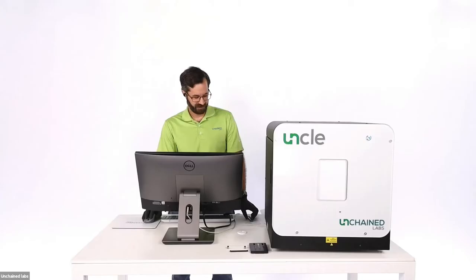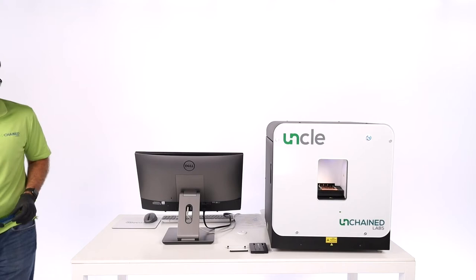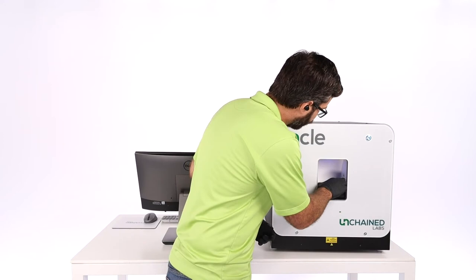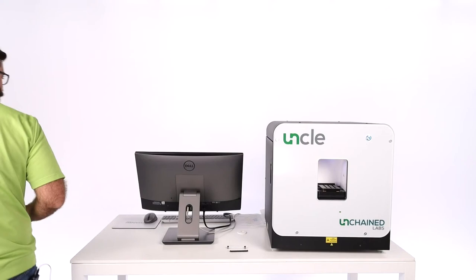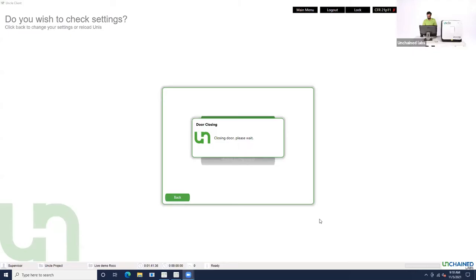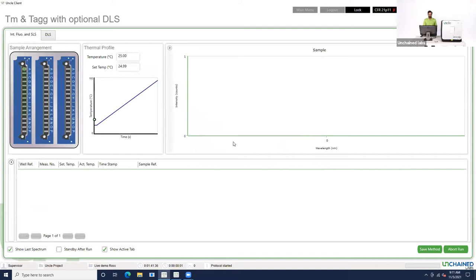Hit apply and we're going to load samples. The door is opening — let me walk around to the front of the instrument and load up our UNI. Door is open. UNI goes in — align the notch with the little peg in the back, gets held in by magnets, and then put the black plastic frame over the top. Looks like everything's nice and secure. Close the door. Door is closed, samples are all loaded. Now just hit quick start and UNCLE's off to the races.